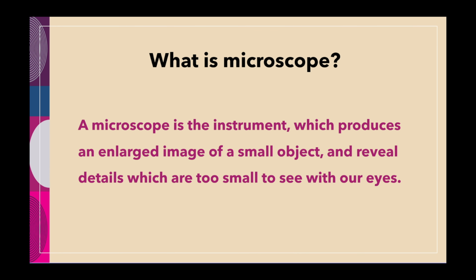So the first question that may come in an exam is: what is a microscope? A microscope is the instrument which produces an enlarged image of a small object, and it reveals the details which are too small to see with our eyes.